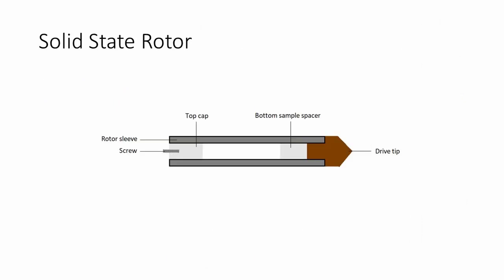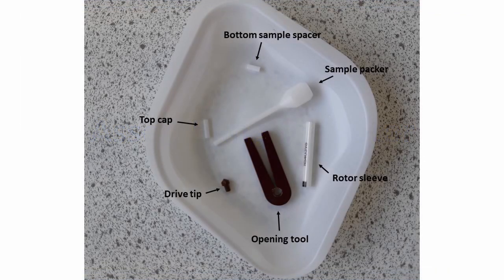In order to do MAS NMR, the sample needs to be rotated at high speed about the magic angle and, to do this, we need to load the sample into a special rotor. Today we will show you how to pack and unpack a solid state rotor using a solid sample. The 4mm rotor is made of zirconium oxide and can spin up to 18 kHz. The rotor sleeve is complemented by a drive tip, a bottom sample spacer, and a top cap. Other accessories include a sample packer and depth indicator, a top cap extractor tool, an opening tool, and a loading tool.